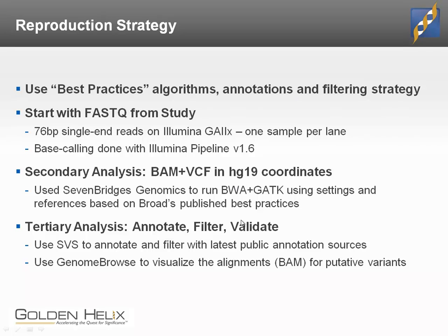So the next step is to decide how we're going to do the post variant list analysis. And again, this variant list, if it was produced in a CLIA lab like you can order from Illumina these days, is still the starting point of the interpretation process. Even if this variant list is CLIA certified, there's still a lot of choices to be made in how you get to that putative, validated, interpreted, annotated variant that might be the cause of a disorder.